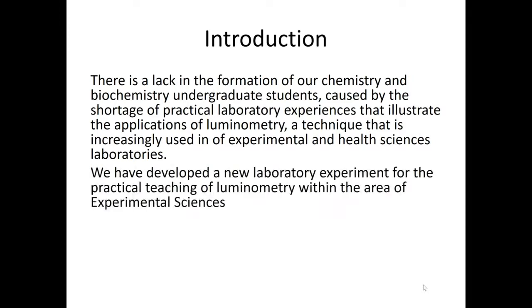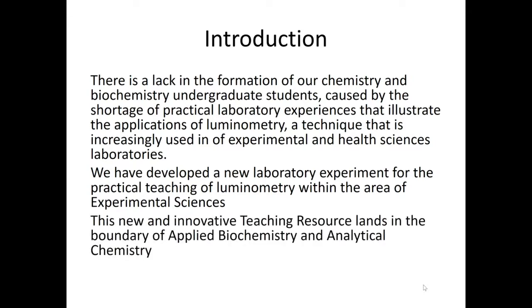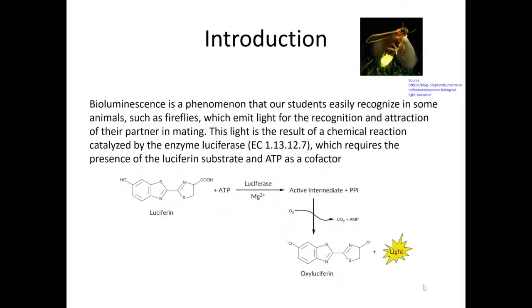For this, we decided to develop a new laboratory experiment for the practical teaching of luminometry in the boundary of the areas of applied biochemistry and analytical chemistry. This experiment is based on the reaction that is catalyzed by luciferase. Luciferase is an enzyme responsible for the light production by fireflies and other bioluminescent organisms, which emit light for the recognition and attraction of their partner.